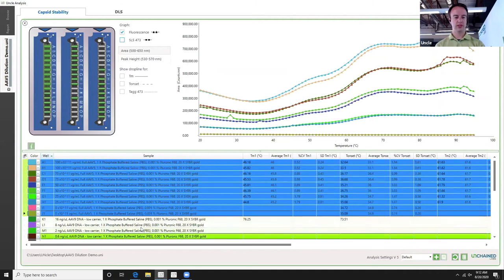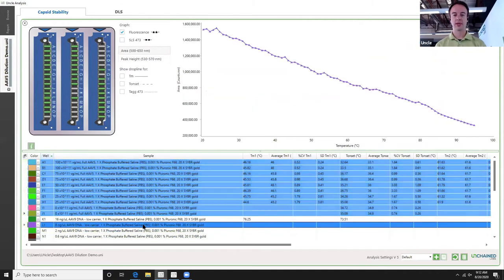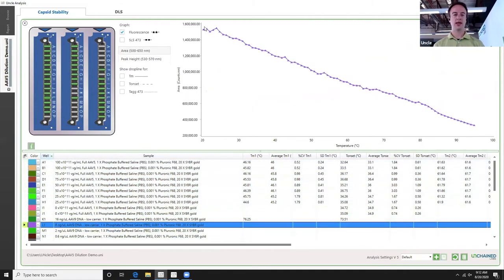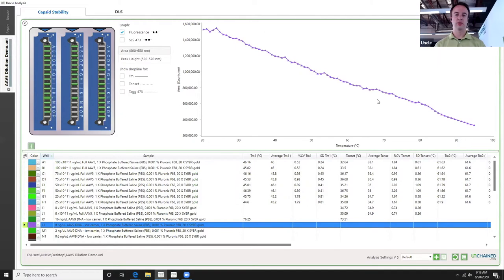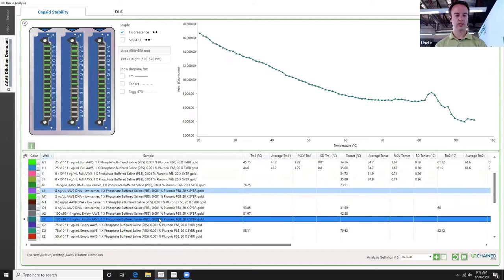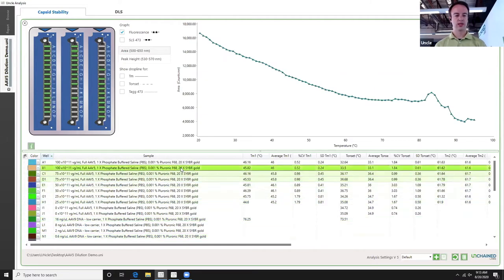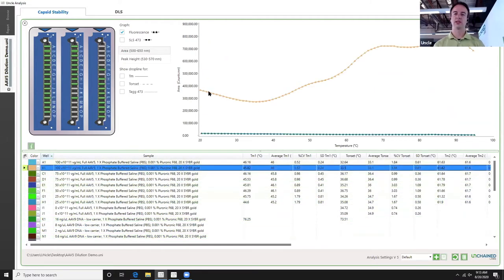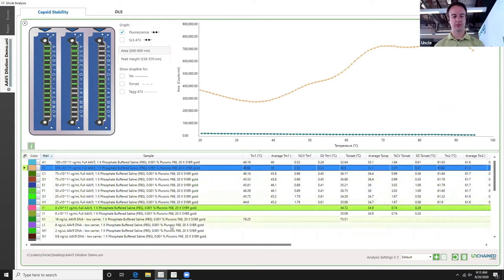If we want to compare these results to simple DNA, we can click this button and see that here we have the initial fluorescence of SYBR Gold, and then it just decreases a little bit as we increase the temperature of our sample — which is expected. We can also take a look at empty AAV capsids and compare those to the signal from a full capsid, understanding the order-of-magnitude difference when we have DNA present in the sample versus when we don't.